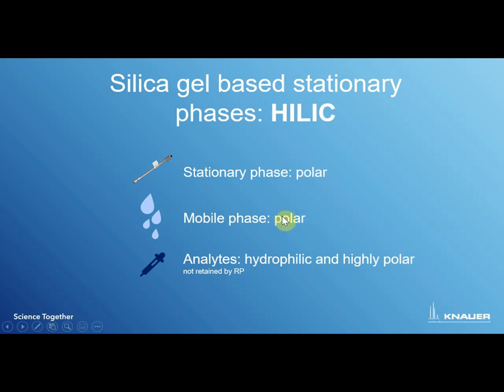And maybe you don't really get it from the first moment why a separation might work, where the stationary phase and the mobile phase have such common characteristics. This is caused by the analytes and by the mechanism itself.